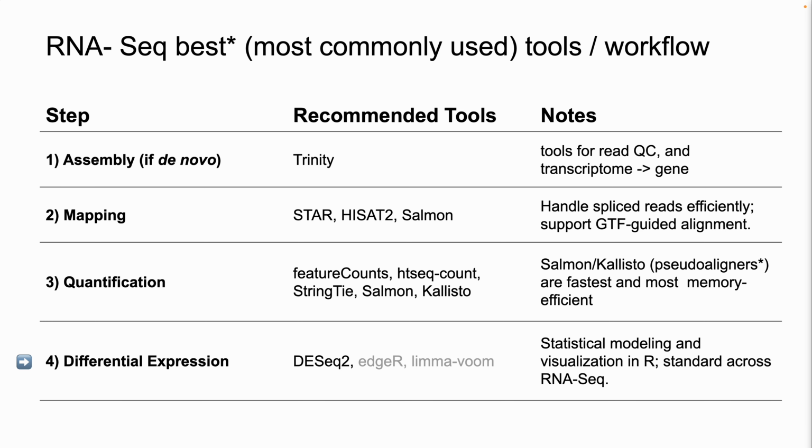And then differential expression, the reason we started that pipeline in the background is DESeq2, which is what everyone uses, only has an R implementation right now.